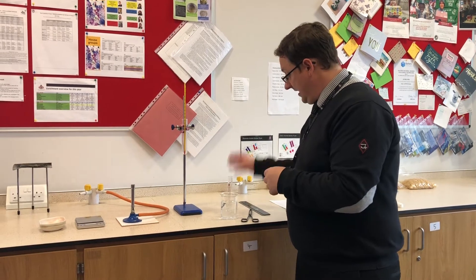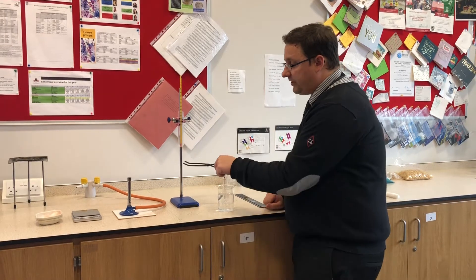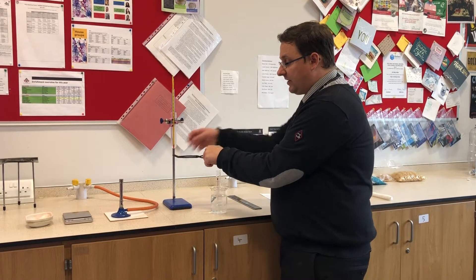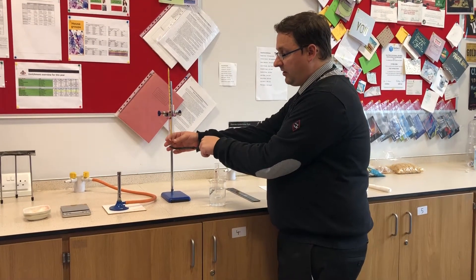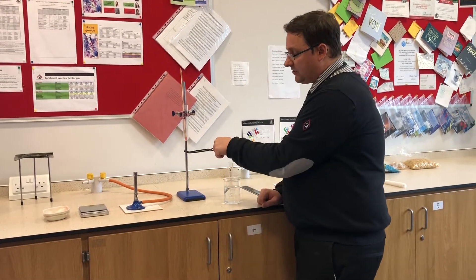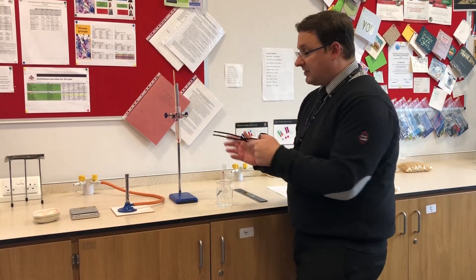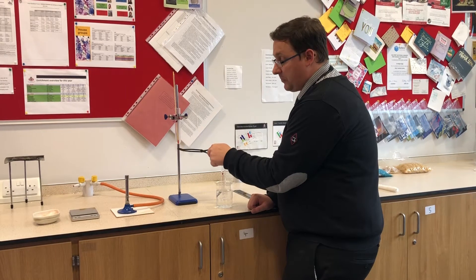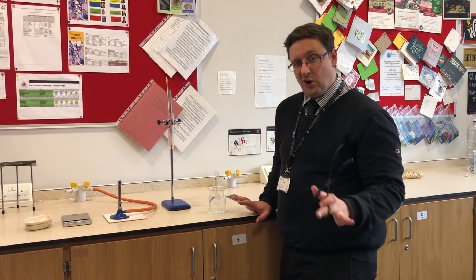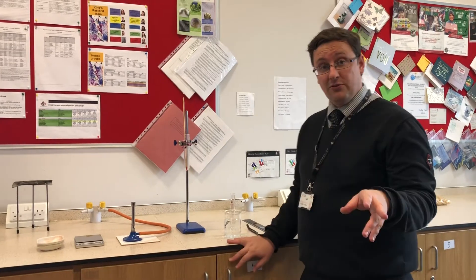The next thing is to make sure that when I'm burning food I hold it at the same distance under the boiling tube. If I hold it really close, all the energy is going to go into the water. If I hold it really far away, a lot of it is going to be lost. I have to make sure I'm always at that same distance - whatever distance I choose, it's got to be the same. I think I will go closer.